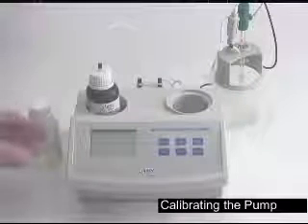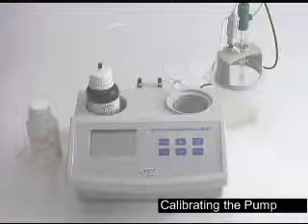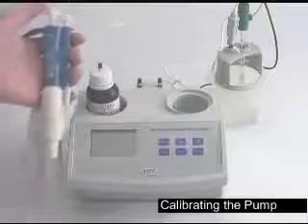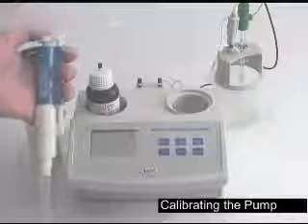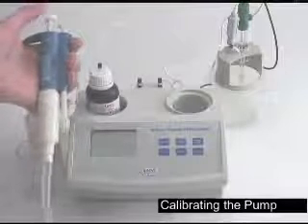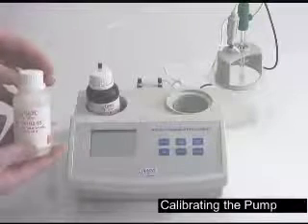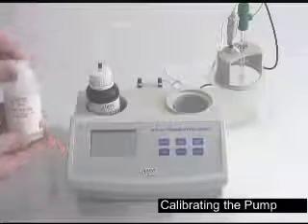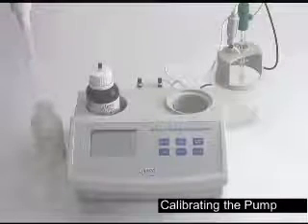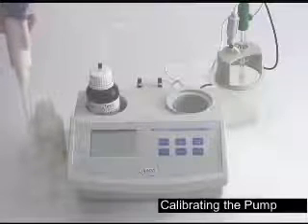We're going to take a clean beaker, add the stir bar, take the auto pipette that was provided. This is a 2-stage pipette. And you go down to the first stage, put it into your titrant, lift it up. When purging it, you'll use the second stage. Take the 84102-55 standard. Again, first stage. Place it in your beaker.